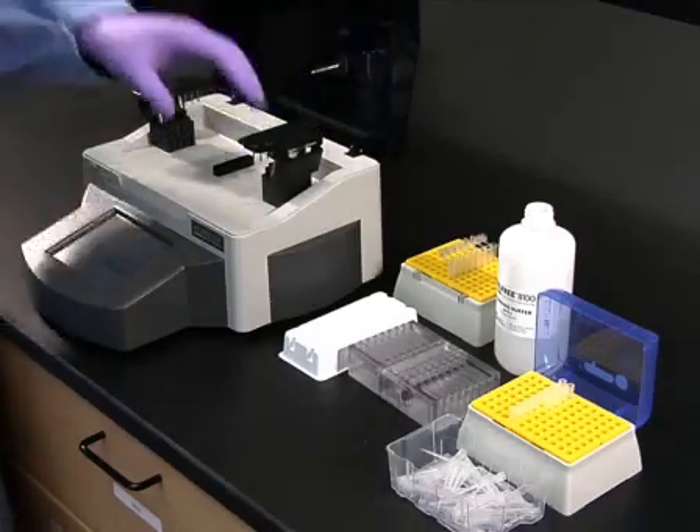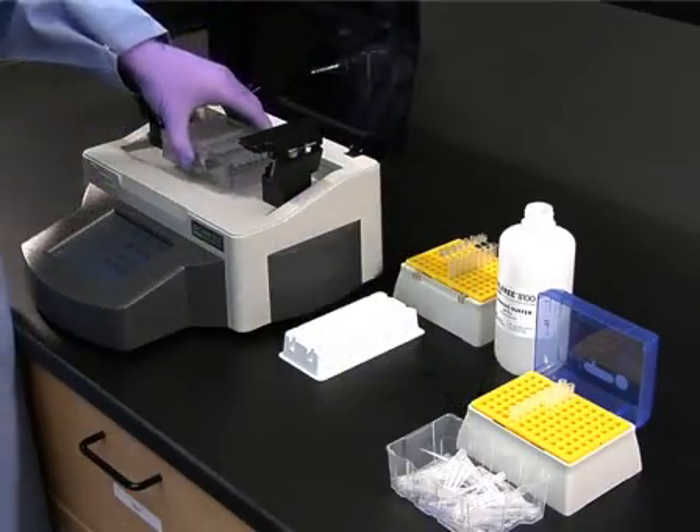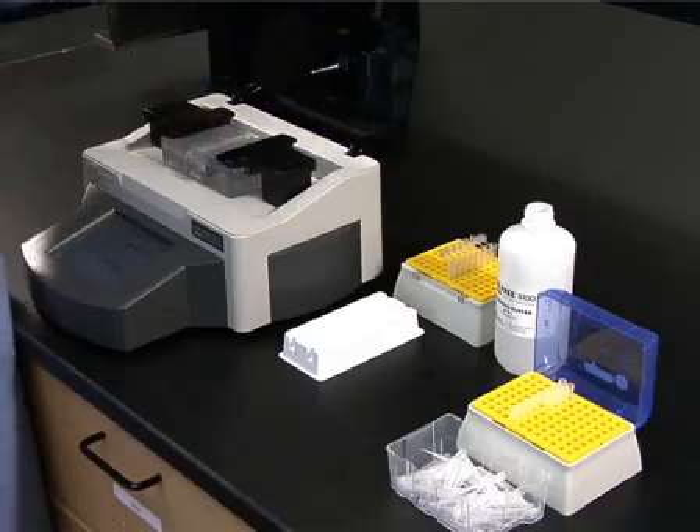Once the samples have been loaded, place the cartridge into the GelFree 8100 fractionation station. Then lower the electrode arrays and close the lid.